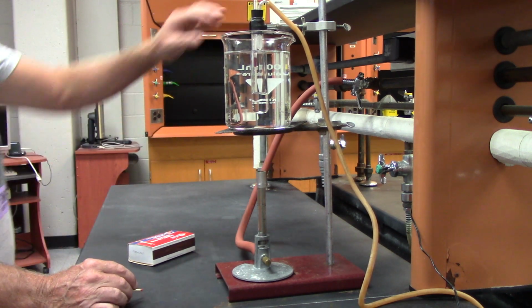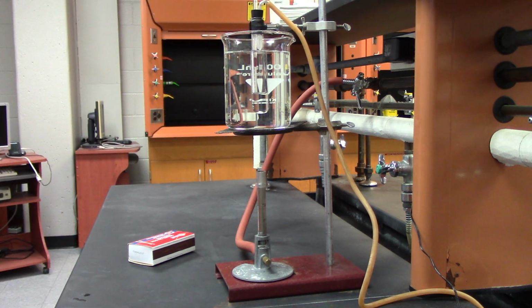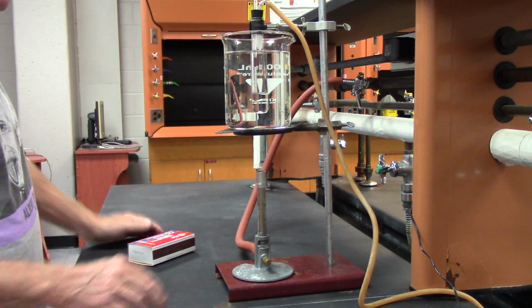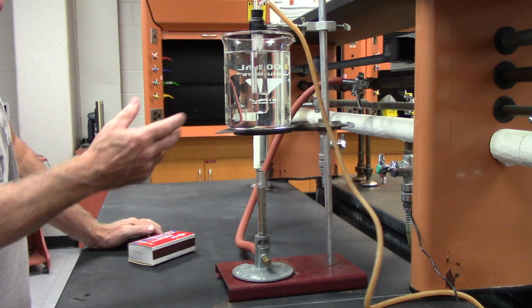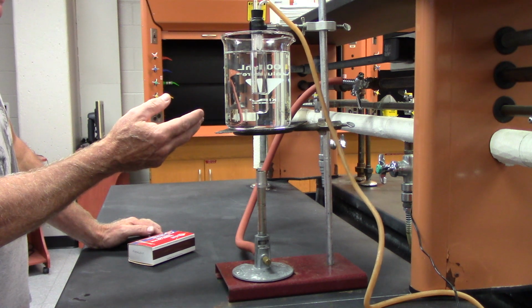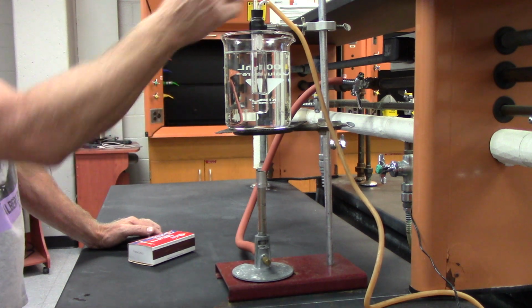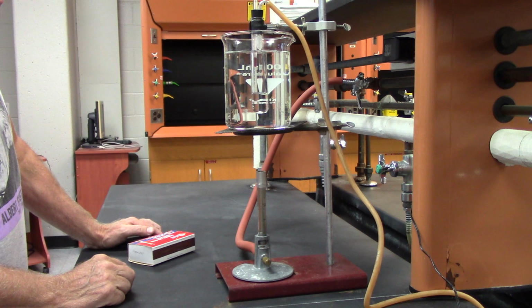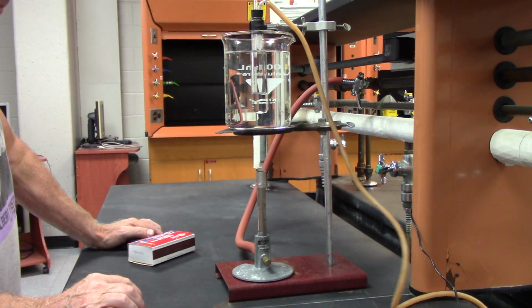This thing holding the test tube is a test tube clamp. This rubber hosing is in case, when we get to boiling, some of the liquid turns to gas; if there's too much gas, it could blow the stopper off. So this is a sort of release valve, a safety valve.